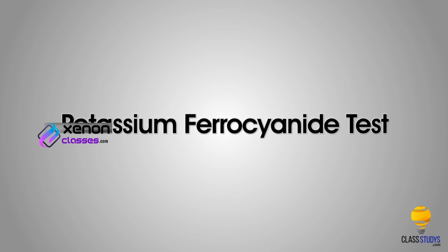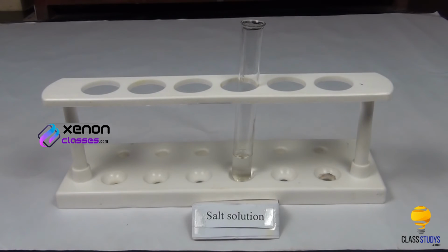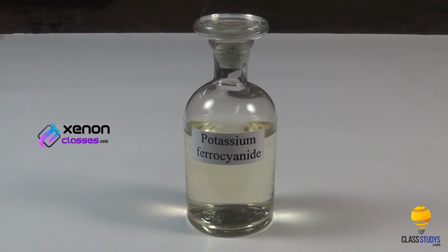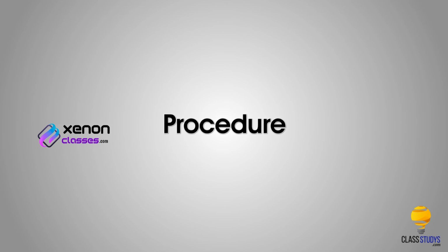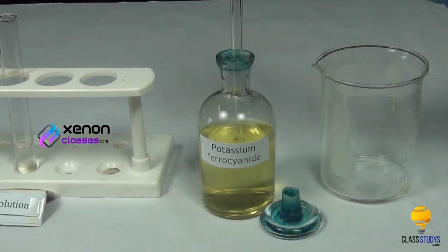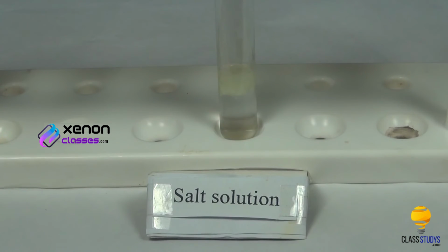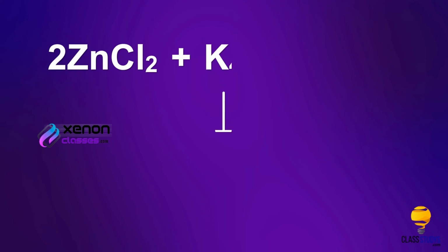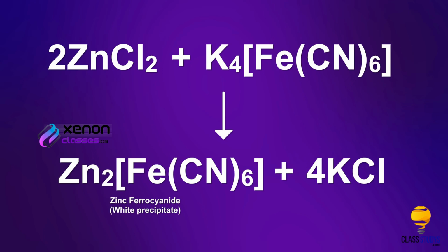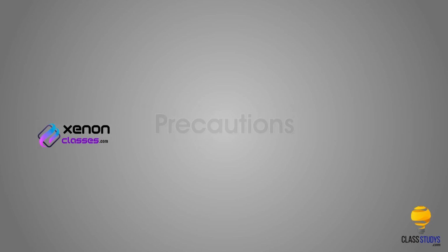Potassium ferrocyanide test. Materials required: salt solution in a test tube, potassium ferrocyanide solution and dropper. Procedure: take a small quantity of potassium ferrocyanide solution using a dropper. Add into the salt solution taken in a test tube. Shake the test tube well. Zinc ions present in the solution react with potassium ferrocyanide to form a white precipitate of zinc ferrocyanide.